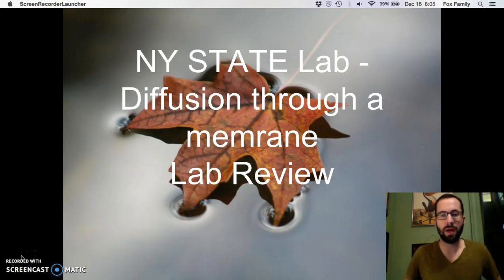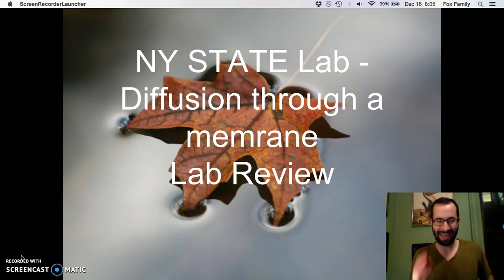Hello, this video represents a review of the New York State lab, diffusion through a membrane, the one with the onion cell and also the model cell. You should only be watching this video after you've completed the lab and given an attempt at answering most of the questions. This is also a good way to review for the verbal quiz, in particular the last few questions of the verbal quiz.